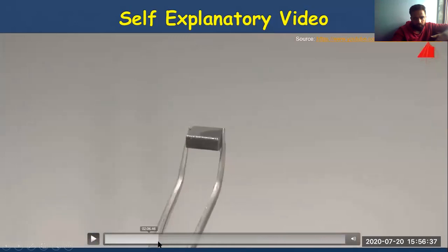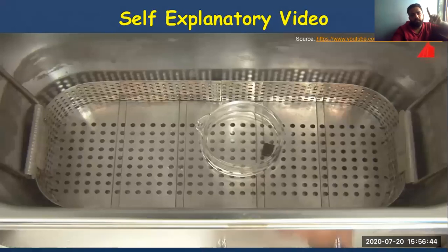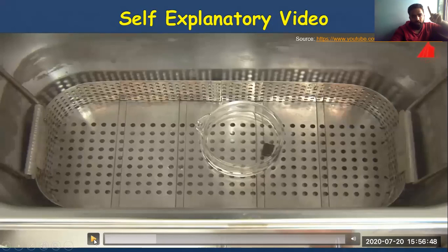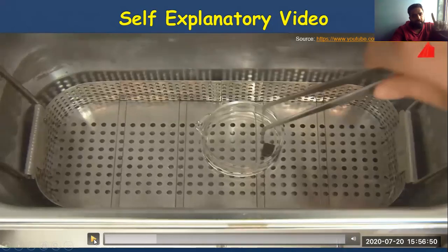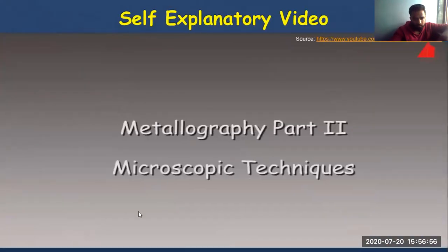One second. I'm just stopping because I want you to know the first step is sectioning. The second step is mounting. Before mounting, they are cleaning. Just look at the steps one by one.